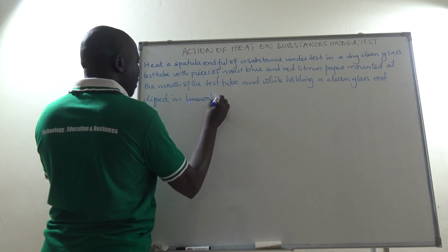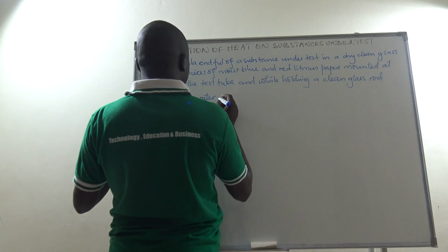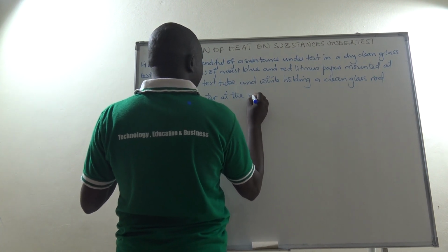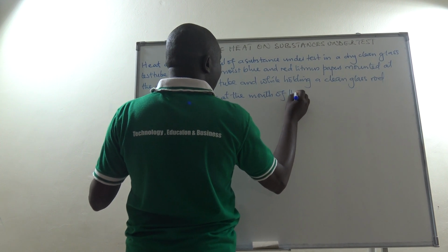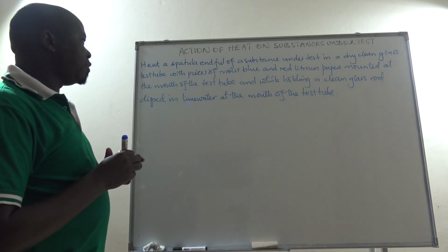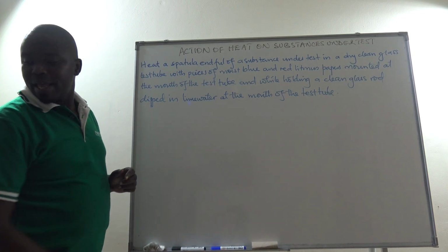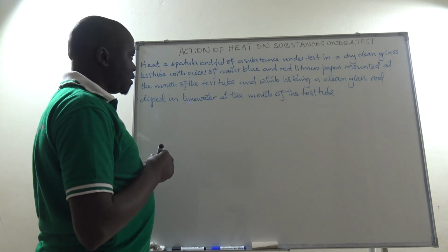Take note of the spelling. Lime water is one word. Dipped in lime water at the mouth of the test tube. So I believe we are going to understand this one here, though theoretically, but we shall be able to understand how to do it in this case.